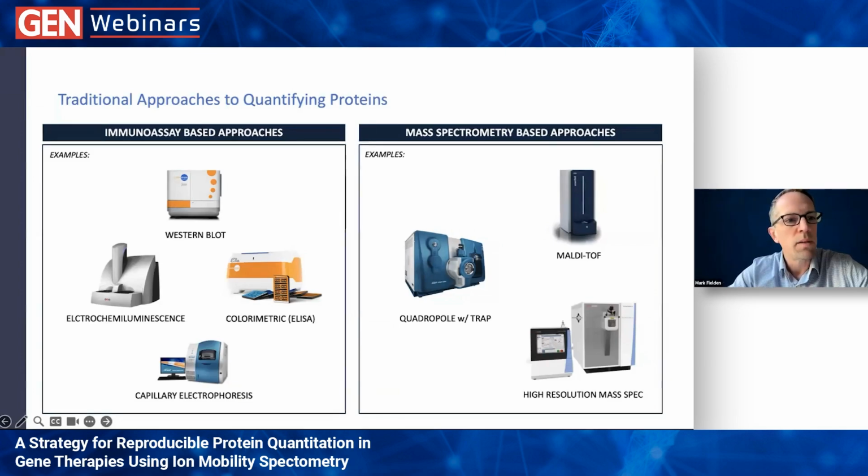Yeah, I can certainly speak to those on the left side of the slide where most of my experience is. The benefits of immunoassays, whether it's Western blots, capillary electrophoresis, or even ELISAs, is that they're generally very accessible to most molecular biologists. We grew up with these tools. We used them in grad school. They're generally more affordable, and so most labs have that capability.